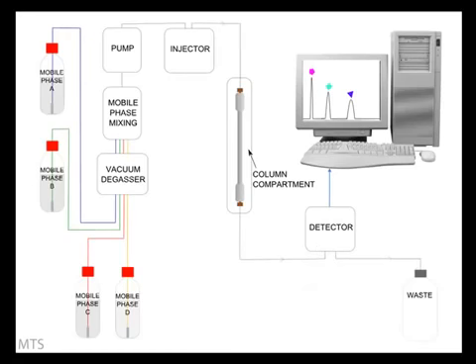Overall, the blue component spends more time in the flow path and has more time to spread out. This results in a broader peak relative to a component which has passed through in a quicker time, such as the pink in this example. Whether this band broadening effect is as noticeable as it is in this example depends on the actual method parameters being used. Here you can see that the peaks are progressively broader as time passes.